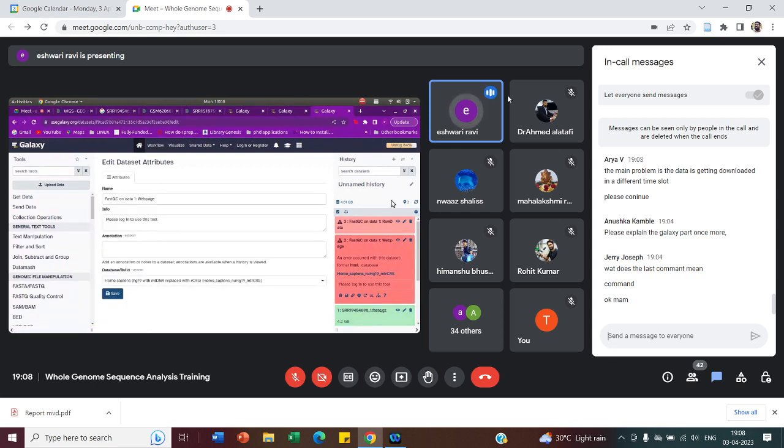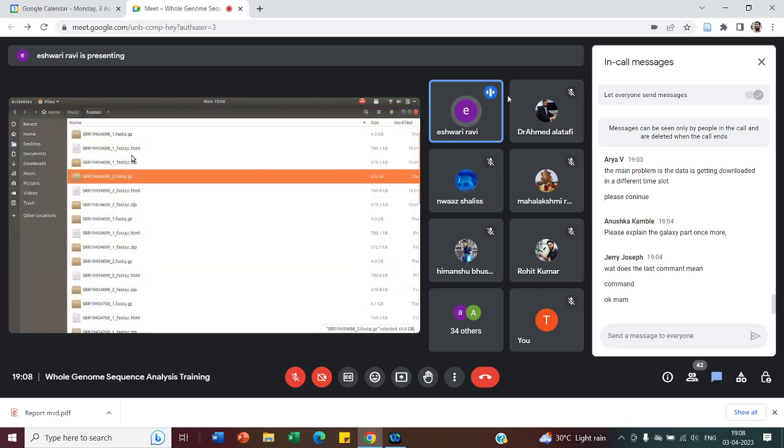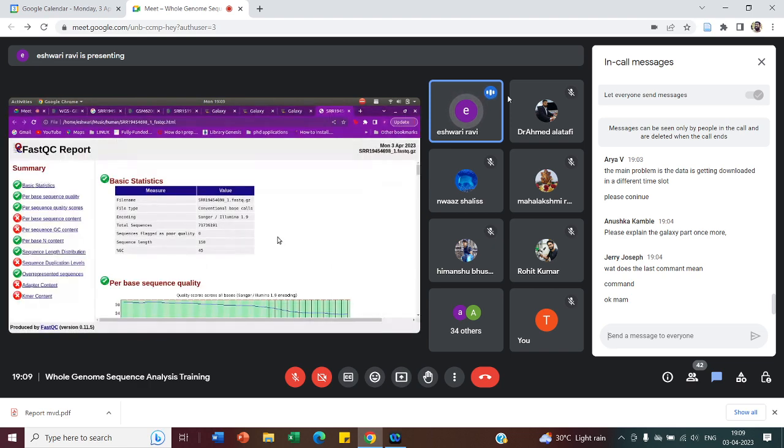So I'll have to log in over here to access. First I'll have to log in and then I can access the web page. But usually the previous result which I showed should be displaying to you like this HTML. It'll redirect to the HTML page.